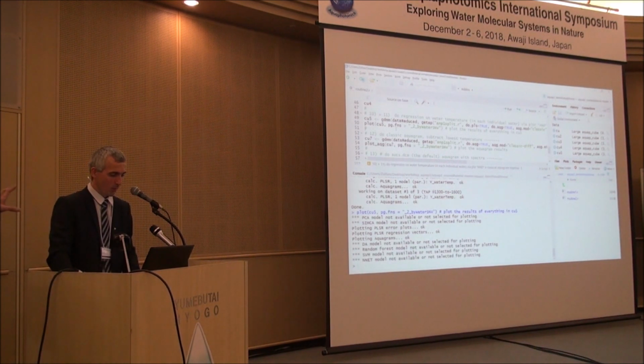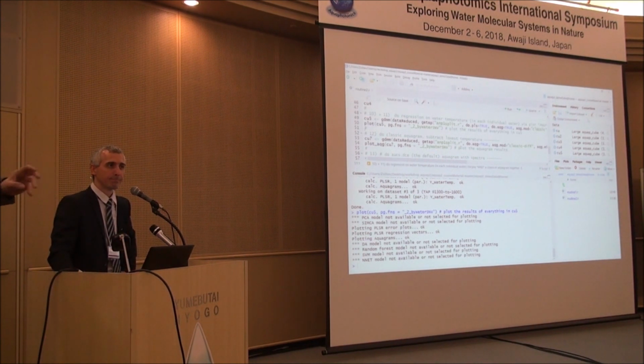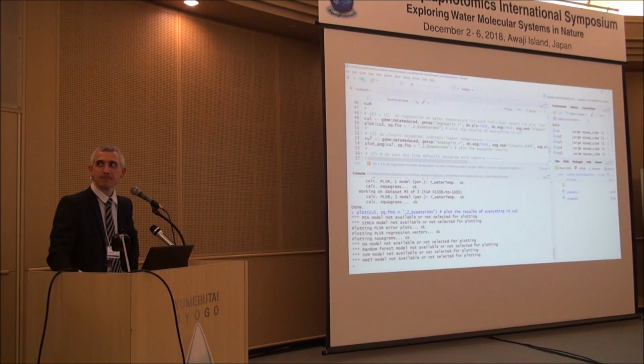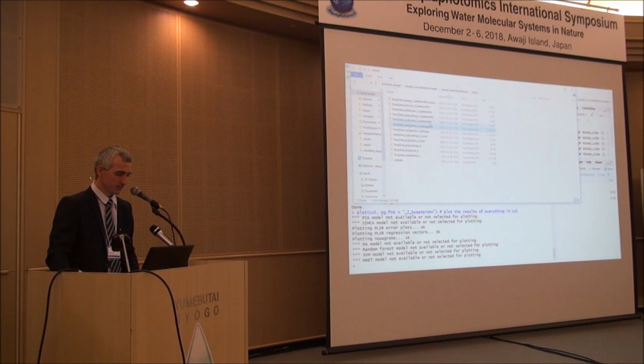Okay, so a little bit more in depth here. What we did now, we made a regression on water temperature within the subgroups of 3 different water types, and we made an aquagram, the classic aquagram, just describing the temperature within each of the individual groups.